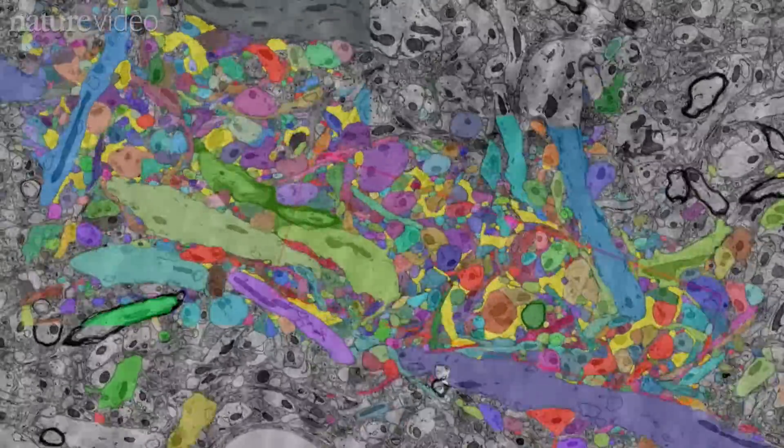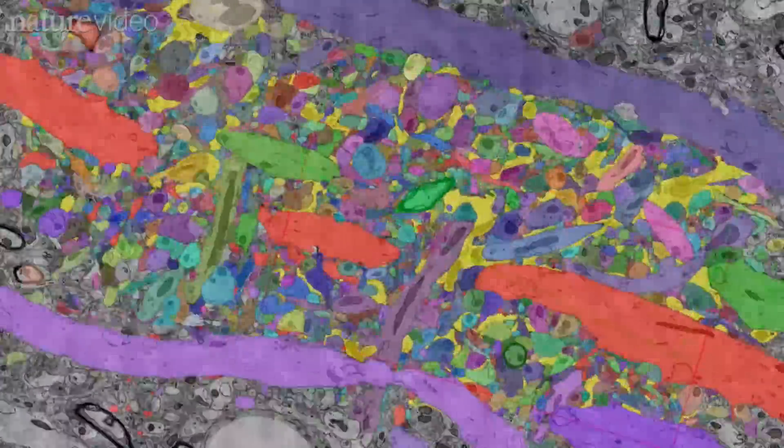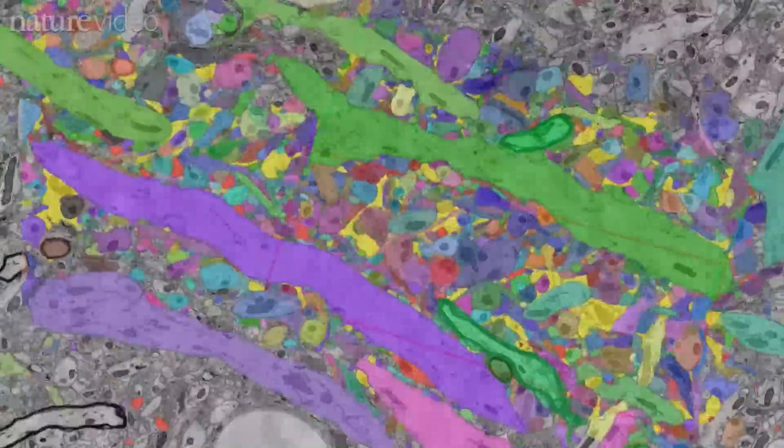Here we're moving through the stack of brain slices, like a flipbook. The team took these still images and crunched the data to rebuild the piece of brain tissue.